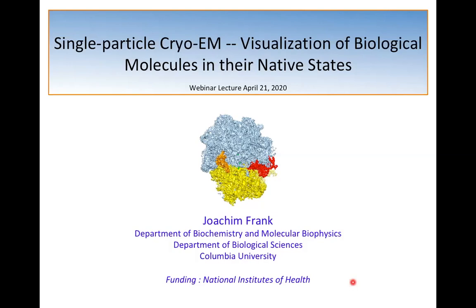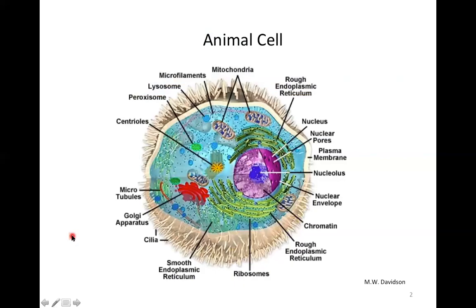So today, I'd like to talk about single particle cryo-EM, visualization of biological molecules in their native states. So I'm showing the animal cell.